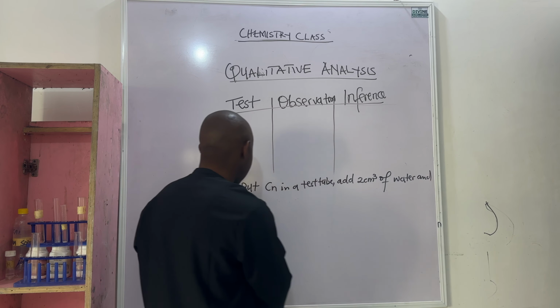The first step is that you should put the Cn. Let's use a common salt here.